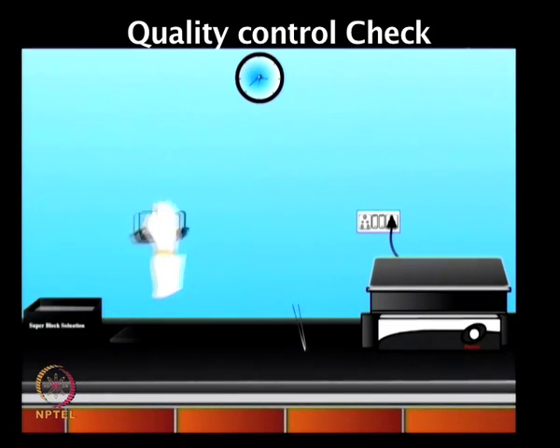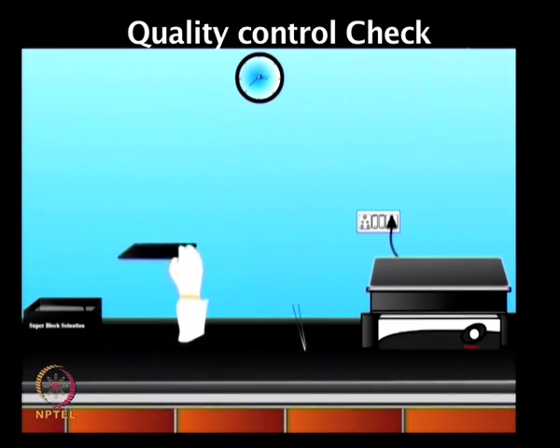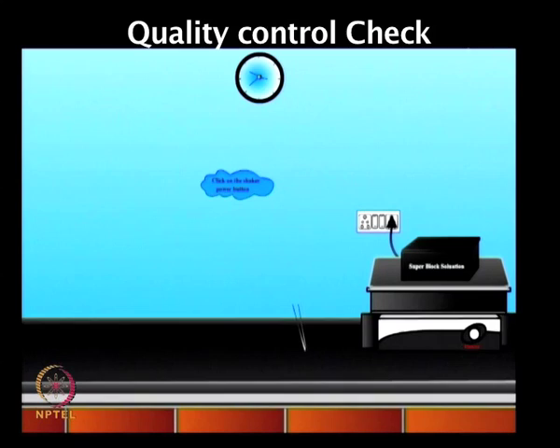The storage form of NAPPA microarrays is merely DNA. So, in an activated array, all following reactions elapse in solution and in real time. Therefore, restrictions caused by the instability of proteins occur very rarely.